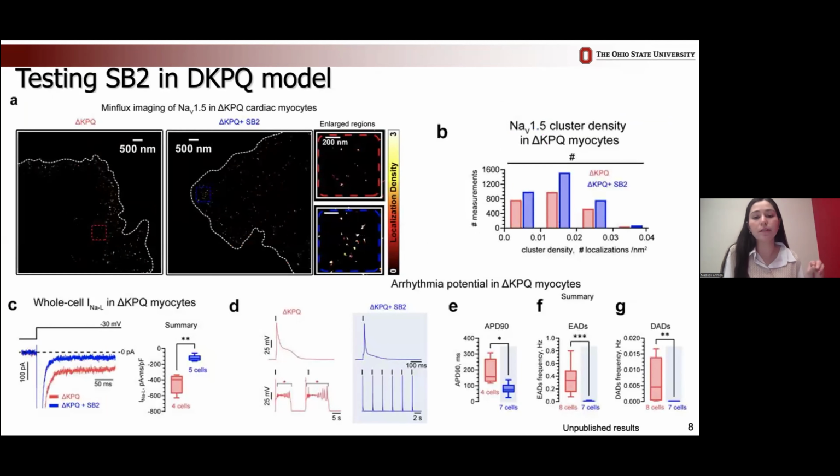Delta KPQ is a mutation that is associated with arrhythmias in human patients. We therefore imaged cardiac cells that were harboring this mutation. We imaged cells that were untreated and cells that were treated once again with SB2 to enhance sodium channel trafficking. And through the same image analysis I previously talked about, we were able to confirm that the presence of SB2 was able to increase cluster density of sodium channels within this mutation.